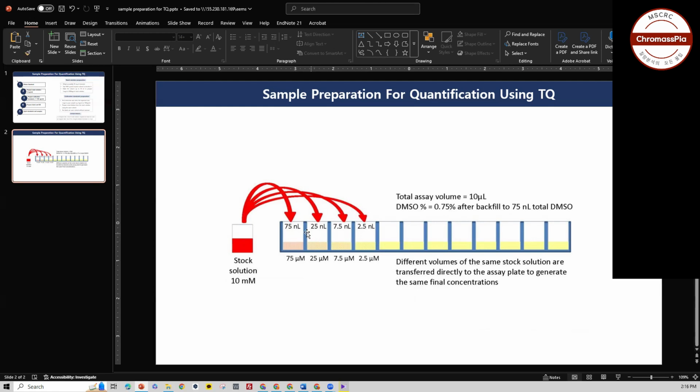If you do this, maybe because of human error, you will be unable to get the proper amount of this solution, and further your calculation will be wrong. But if you have prepared this stock solution with accuracy, then all of your concentrations will well represent your stock solution and its dilution.